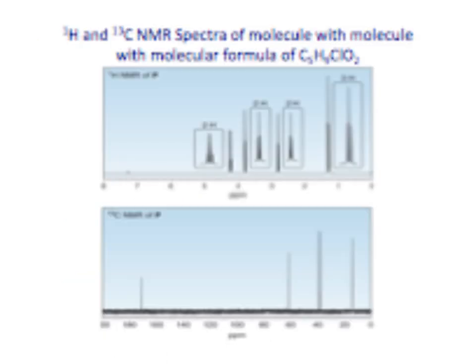Like a mixture of the different isomers. Well, if we have mixtures, then things get much more complicated, obviously, right? And so if they were equal concentrations, then we'd have a hard time telling which peaks went with which molecule, right? If they were in different amounts, if we had a mixture of 2 and we had some that were more concentrated than others, maybe we'd see one set of big peaks and one set of small peaks, and maybe we could analyze it that way. But once it gets to be a mixture, it's very difficult to deal with.